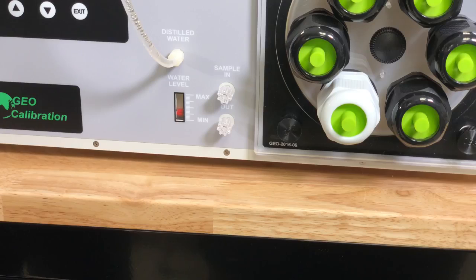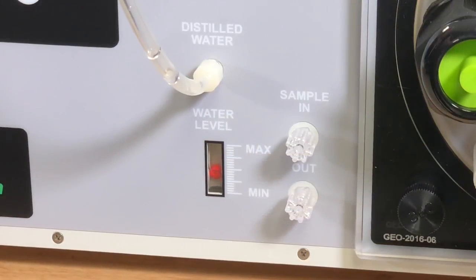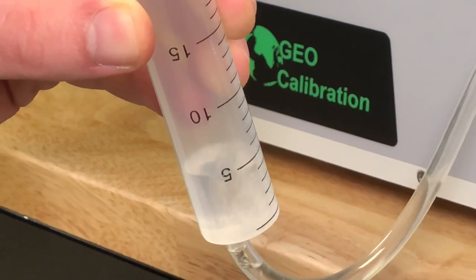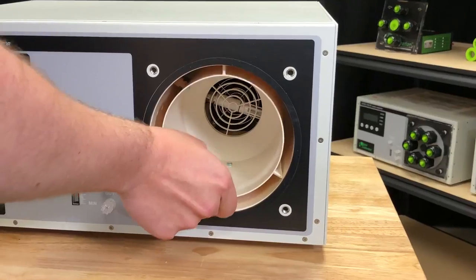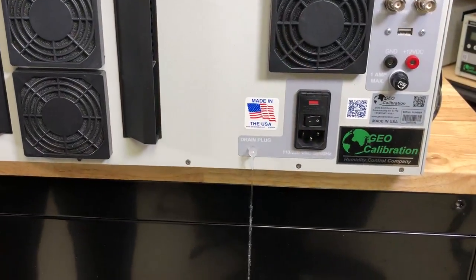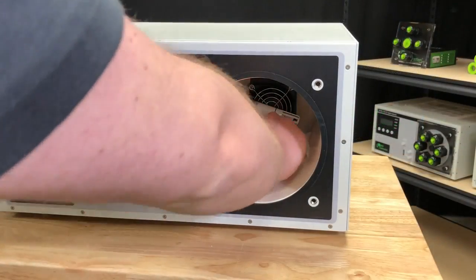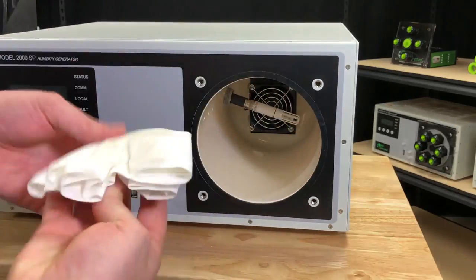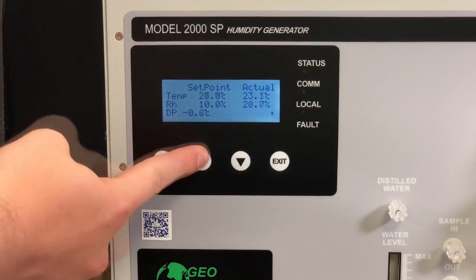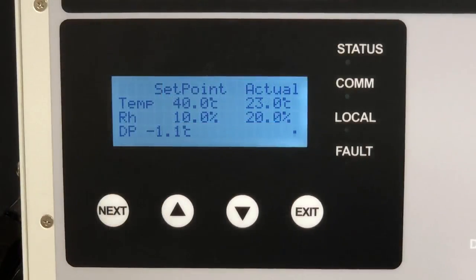When the reservoir is filled, through displacement, you will see the ball move inside the water fill level indicator. If you do decide to add water, be sure to do it in slow 20 milliliter increments. If you add too much water, the saturator will overflow into the chamber, and you'll have to remove water from the reservoir using the drain plug. After that, you'll have to clean up the pooled water inside the chamber using paper towels, reinstall the chamber door, lower the humidity down to 10% relative humidity, turn the chamber up to 40 degrees Celsius, and wait for at least 20 minutes for the residual water to dry.